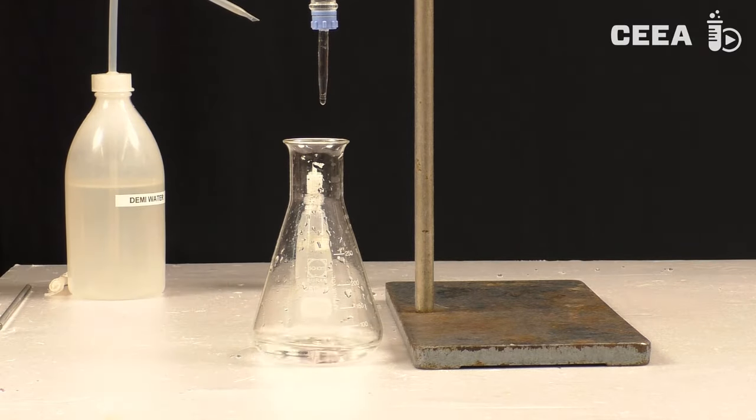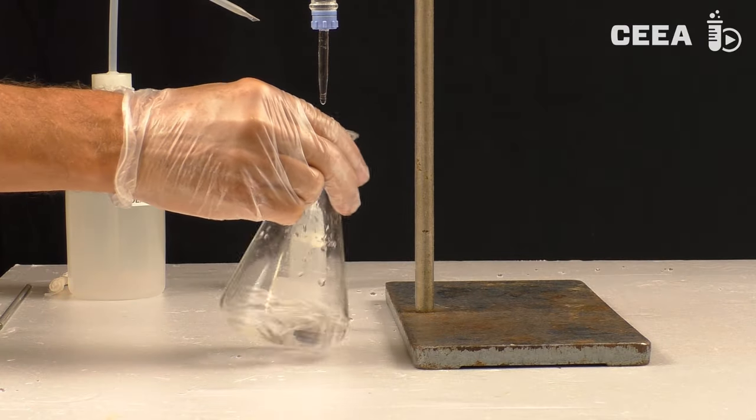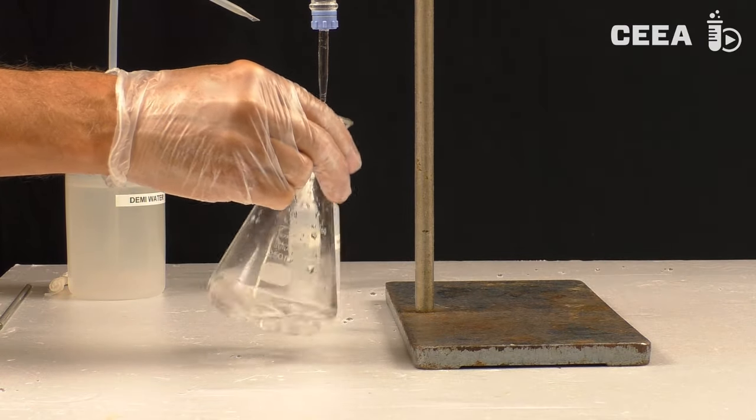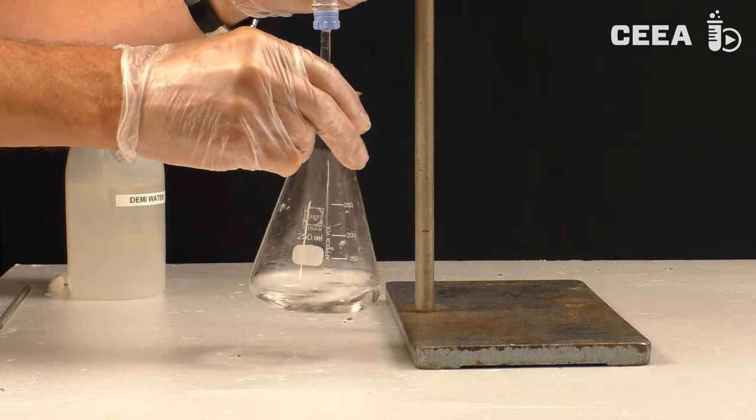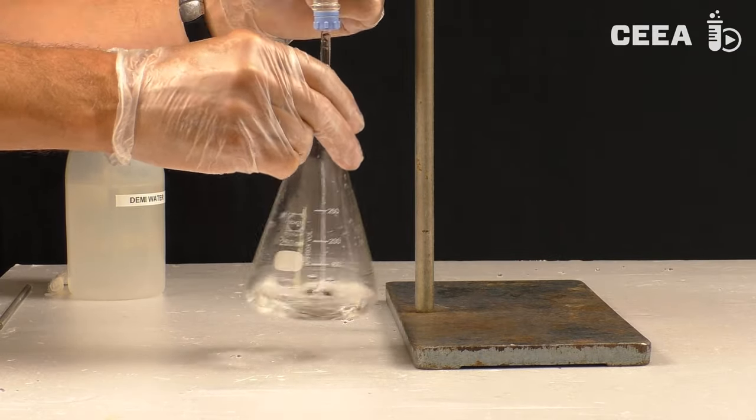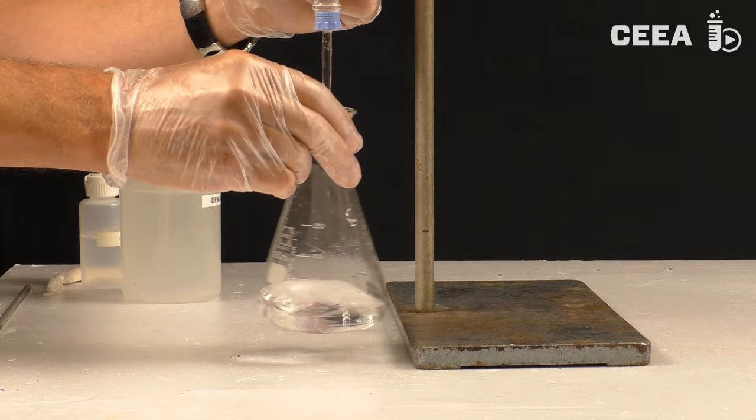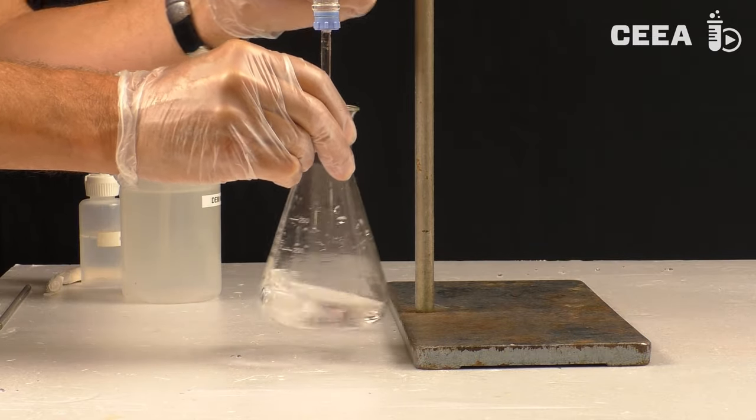Now we write down the initial volume of titrant and start titrating drop by drop. A mechanical stirrer can be used or we have to swirl gently. We have to proceed until a drastic change of colour is observed. The change has to be stable for at least 10 seconds.